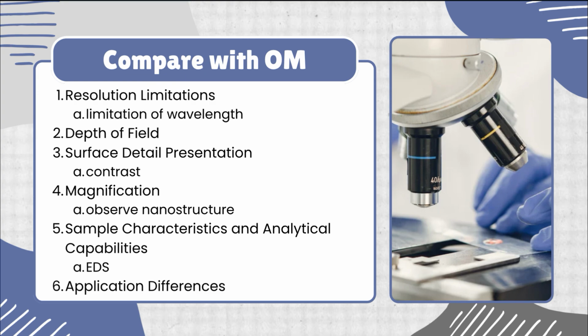And next will be surface detail presentation. OM struggles to display fine surface details and often lacks sufficient contrast to reveal intricate structures. And SEM, utilizing secondary electron and backscattered electron detectors, provides sharp surface details and high contrast, revealing even subtle features.